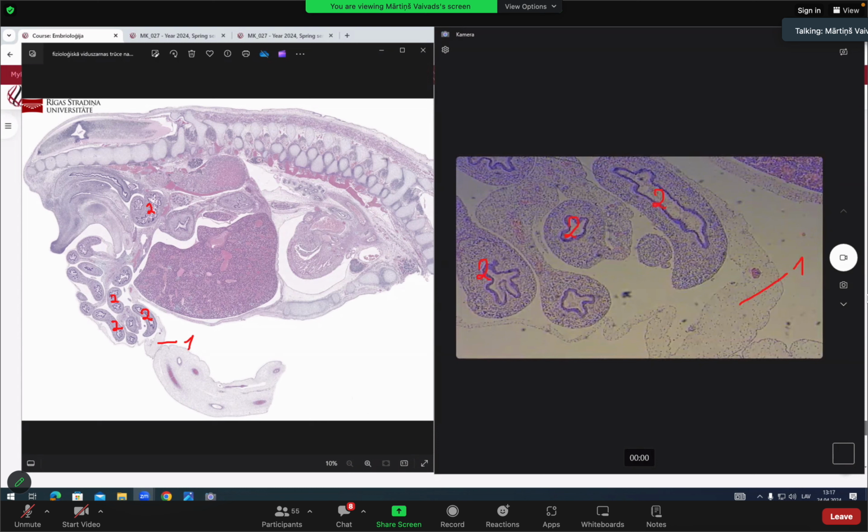That's also an option, but developing small intestine is an okay term. Technically we can ask the same structures that were present in the small intestine slide: epithelium, connective tissue, mucosa, submucosa, muscle tissue around, but developing small intestine loops is the general name for this whole structure.